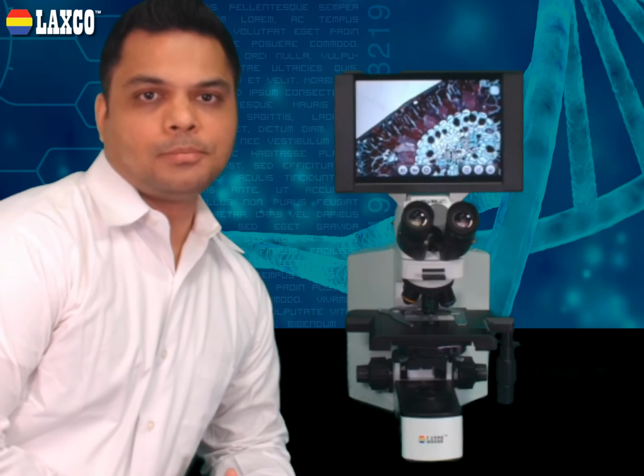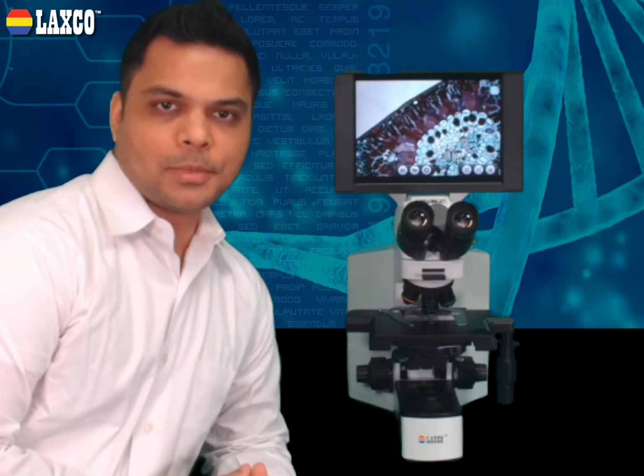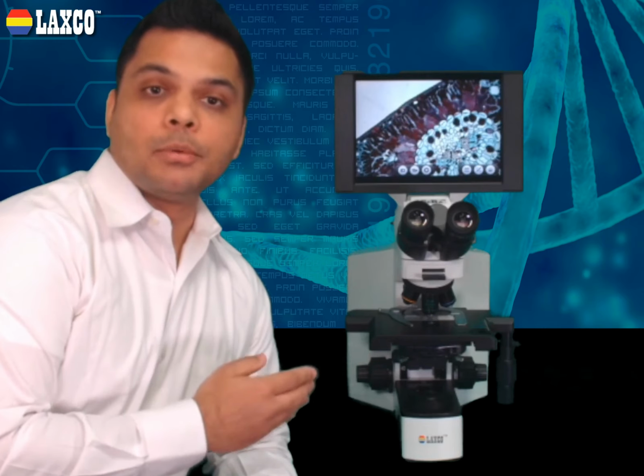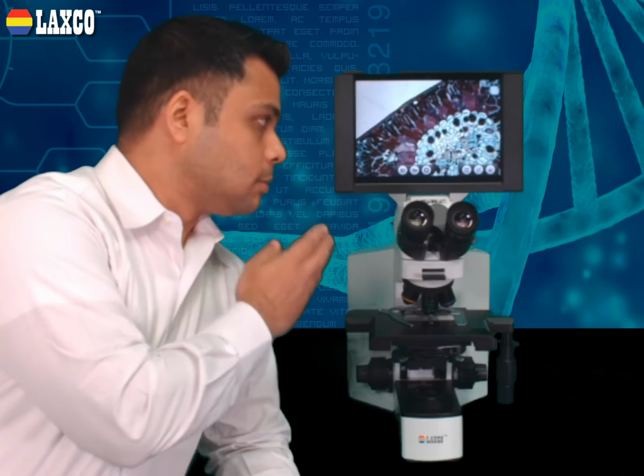So as you just saw, this is a fully integrated system combining a scope, a camera, and a computer with software, which saves you precious bench space. This offers you both the option of having a binocular or a tablet, which is ideal for independent or collaborative work. Data sharing has been really simplified on this platform, so it saves you precious time.